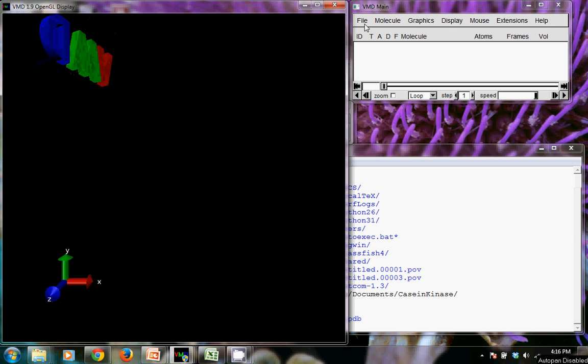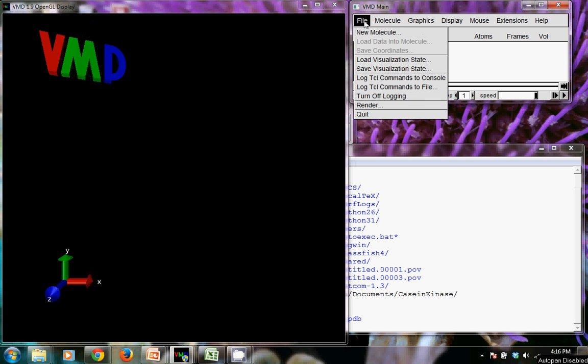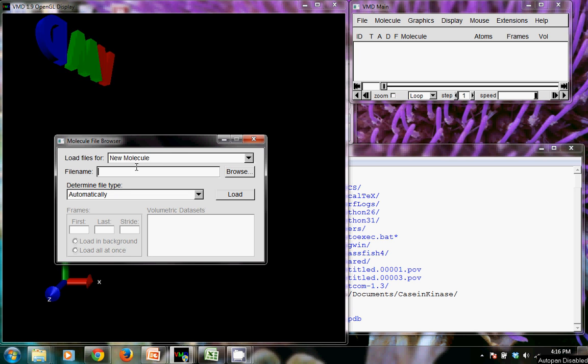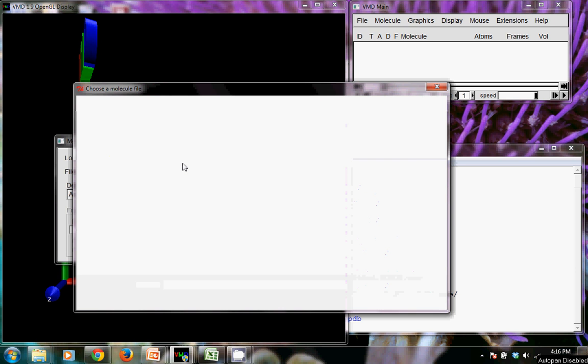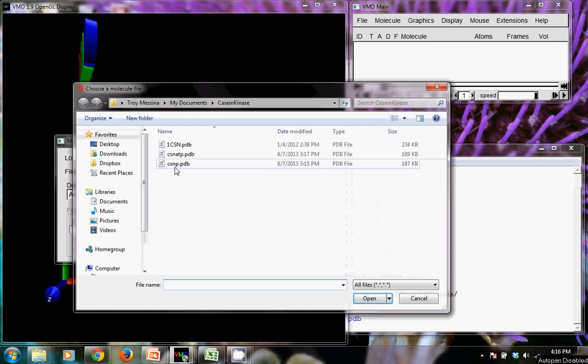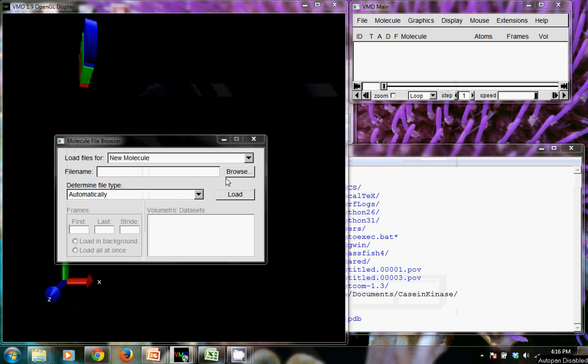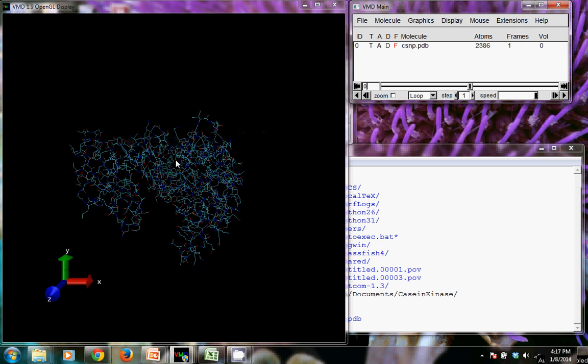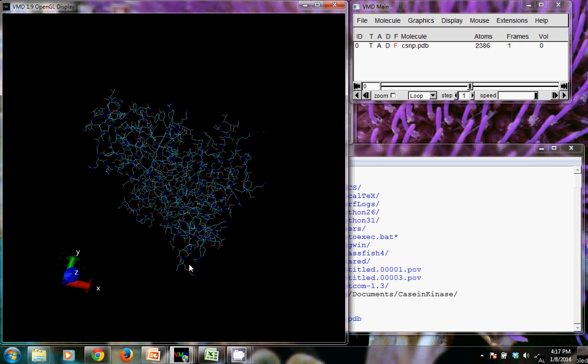So what we want to do is we want to load that PDB file that we just created. That should be CSNP.PDB. And there we have it. If you want to, you can make a nice pretty representation, but it's not all that important right now. All we want to do is create this structure file.